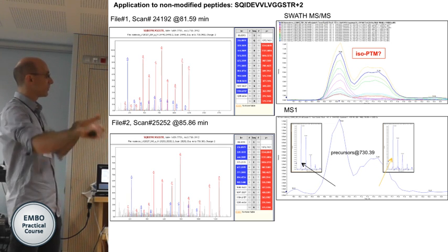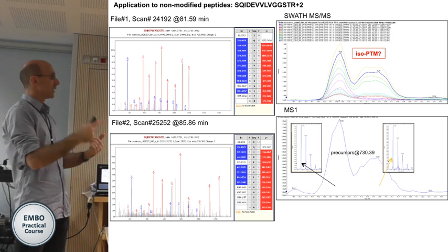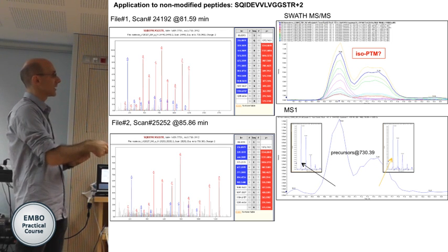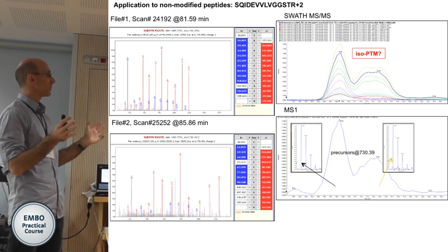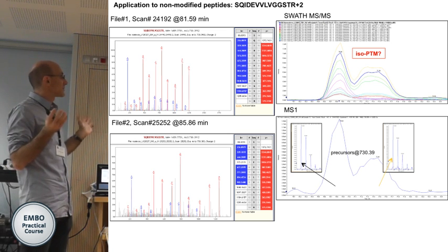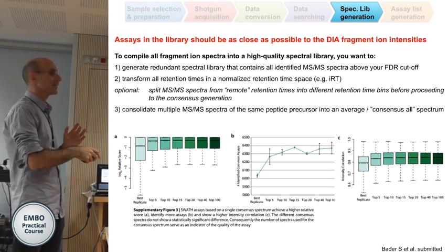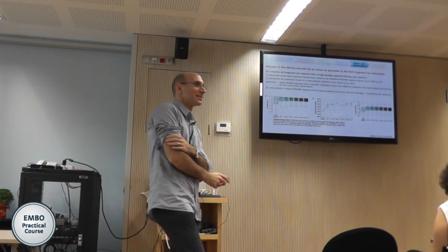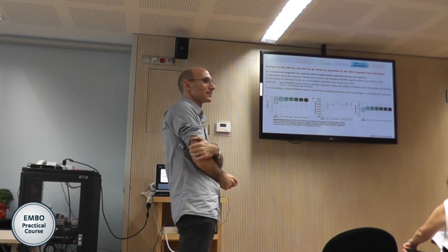If you're not careful about splitting these assays away, you would just merge those two things together, extract one assay, and get just one peak. And here, by splitting this, you start to see very weird things happening, and we still don't know what this is.